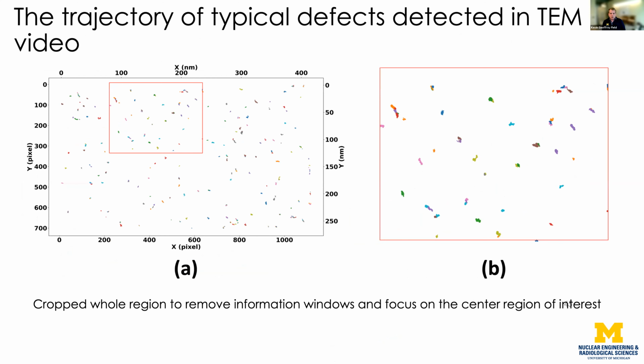All right, so now if you can detect individual defects per frame, if you can track those defects across all the frames, that means now we can track trajectories. So now we know where our defects are moving, how far they're moving. And so what this is here is a plot showing those trajectories, or essentially their position across all frames for the defects. This isn't particularly interesting for the material system that we irradiated because they don't move in reality, but you do see some particular defects moving more, by longer trajectories here than you do, say, individual defects sitting over here. And this is a blow up of this region over here.